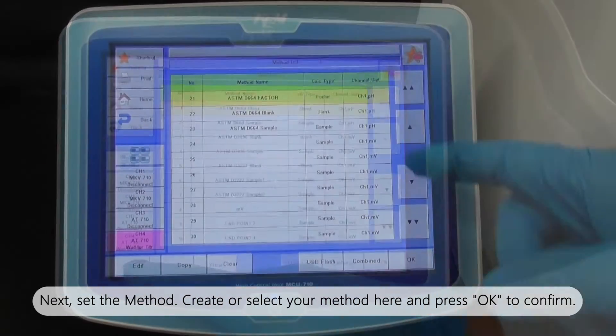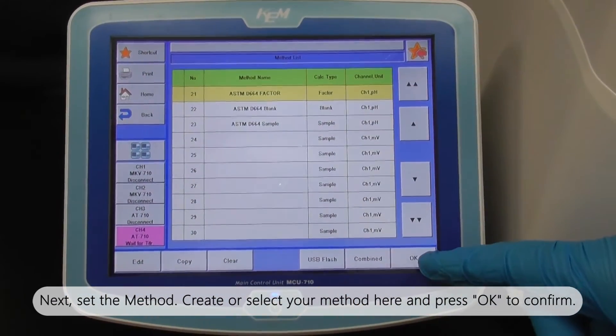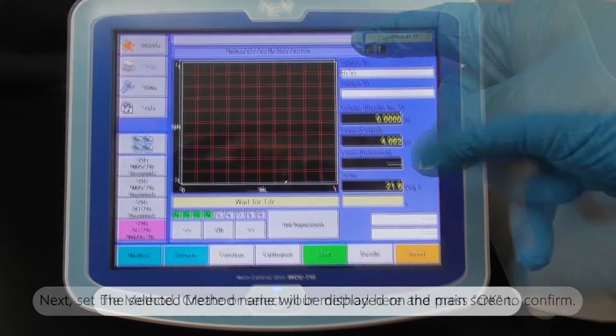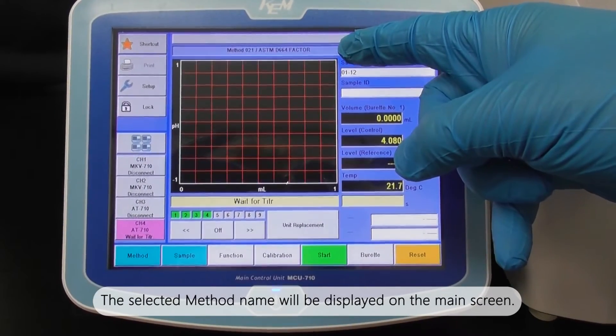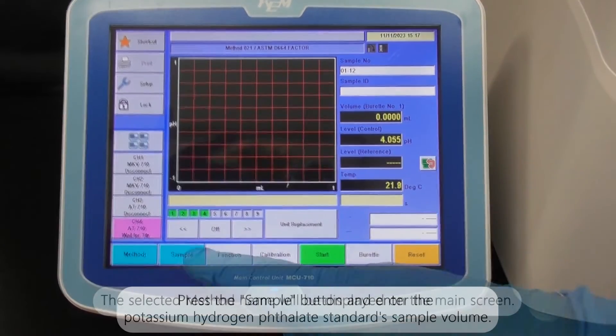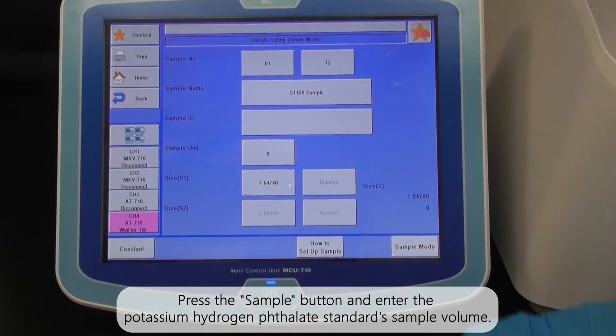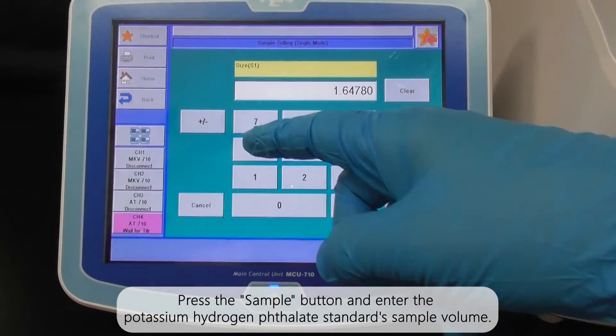Next, set the method. Create or select your method here and press OK to confirm. The selected method name will be displayed on the main screen. Press the sample button and enter the potassium hydrogen phthalate standard sample volume.